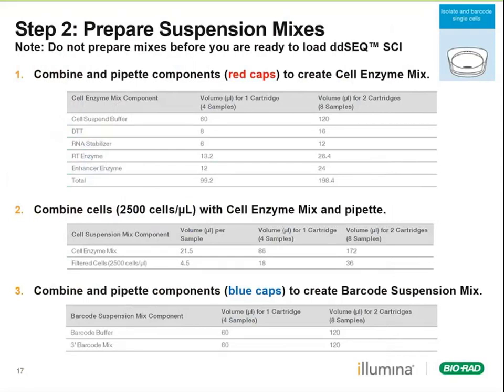Now that we have our cells ready, we can prepare the reagent mixes. A note, we want the reagent mixes to be very well mixed before they go on the ddSEQ SCI, so we don't recommend preparing these in advance. You want to wait until you're ready to load the instrument.